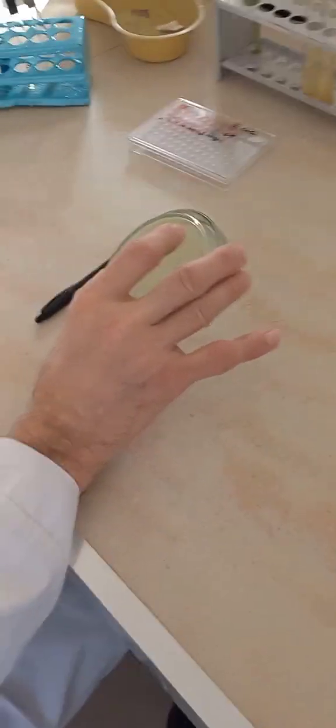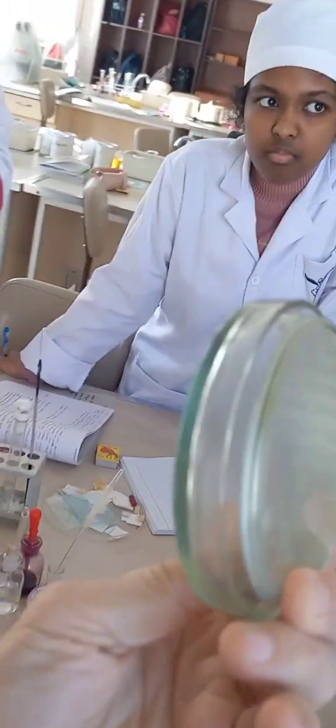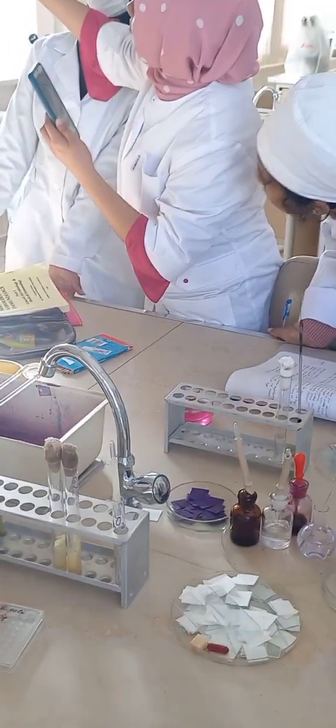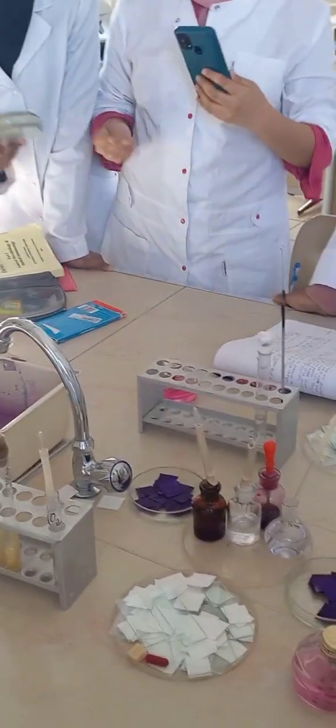So people, here it is growth of colonies. I think from the previous class everyone remembered growth of colonies and so on. Also egg yolk is added here, and you will excellently see, especially through transparent light, that very small colony. But it is totally opaque, like fog surrounds every colony and every streak. You may see. Visible? You may take and look. Every colony is surrounded with the same diameter, or maybe even more, of non-transparent area. It is destroyed lecithin.